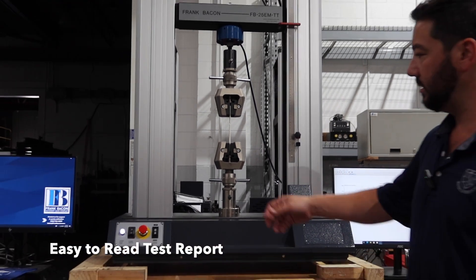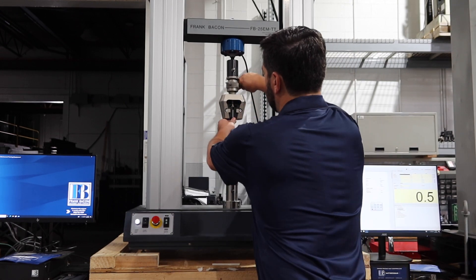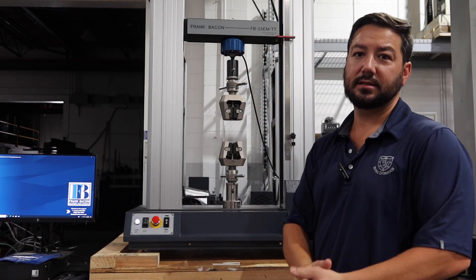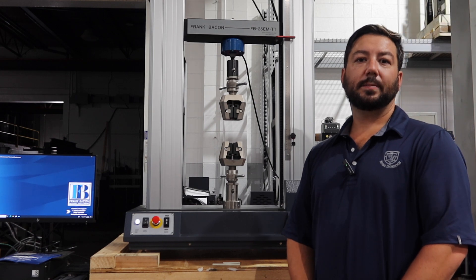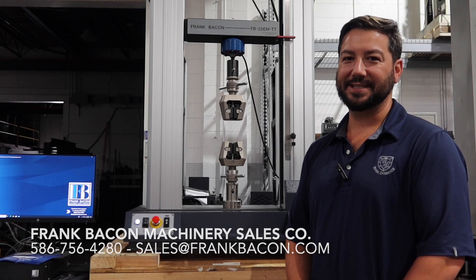And we can move on, release the specimen, and start the next test. It's as simple as that. So if you're in need of a tabletop, easy to use material test system, give Frank Bacon a call. Any of our salesmen here can help you out. Thanks.